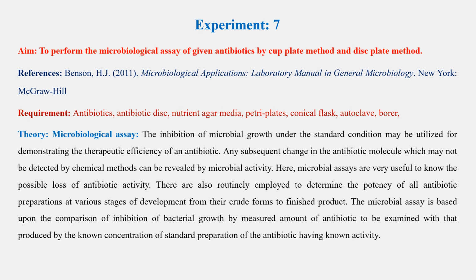The microbial assay is based upon the comparison of inhibition of bacterial growth by a measured amount of antibiotic to be examined with that produced by a known concentration of a standard preparation of the antibiotic having known activity.